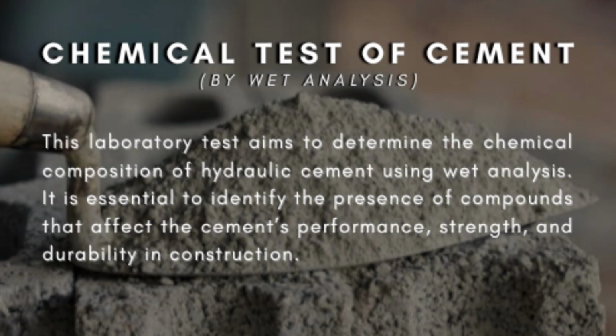Good day. This is our laboratory number 3 in construction materials and testing. In this activity, we will demonstrate the chemical test of cement by wet analysis based on ASTM C114. This laboratory test aims to determine the chemical composition of hydraulic cement using wet analysis.